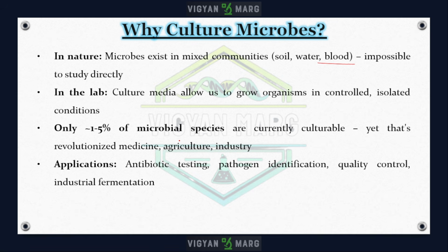So in the laboratory, culture media allow us to grow organisms in controlled and isolated conditions, where we can grow them in a pure form, manipulate the conditions, and observe specific properties.